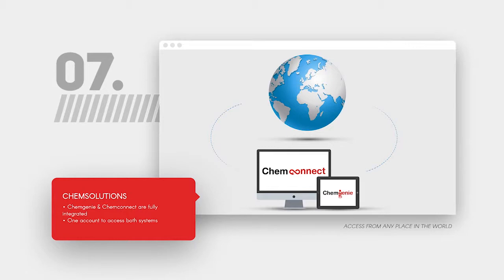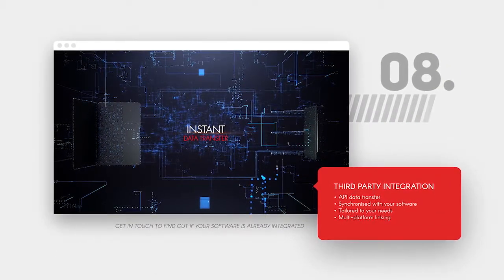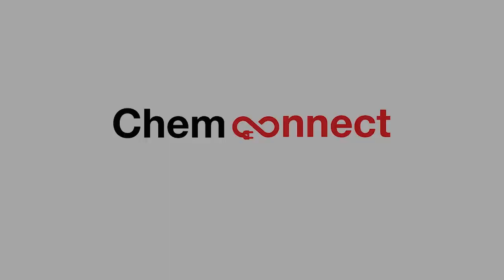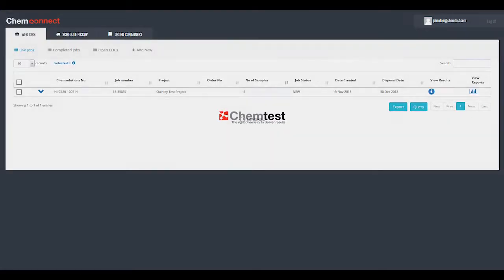Before the platform can be used, you must contact your account manager so that an account can be set up. This information will be sent via email to you. After you log in, you'll be presented with the dashboard. From this screen, you can access the following sections and their subsections.